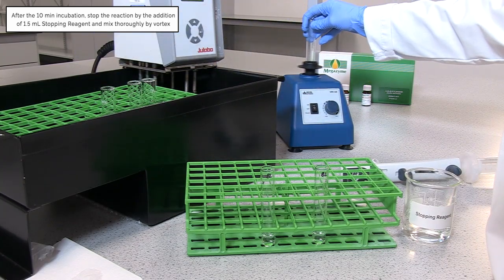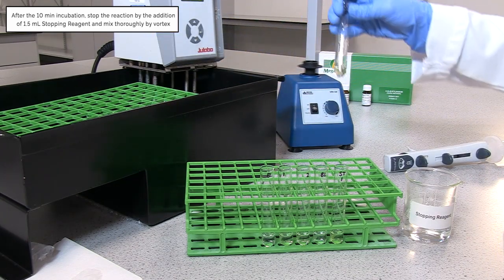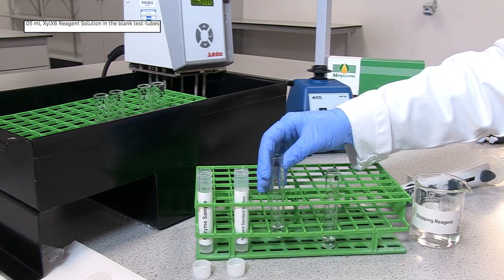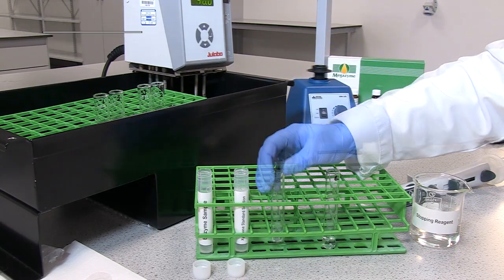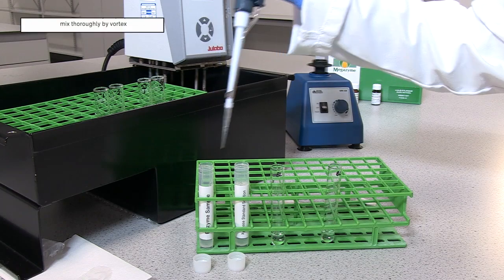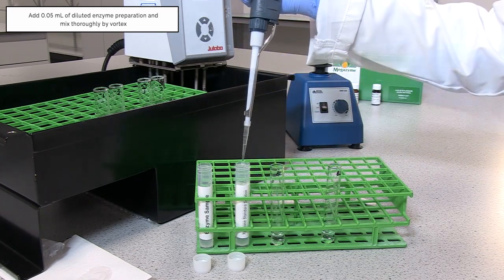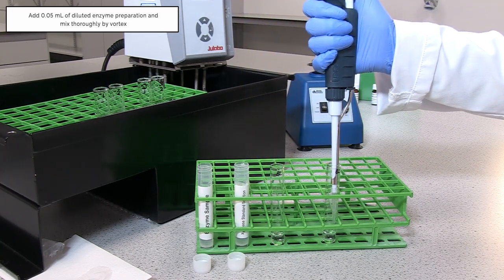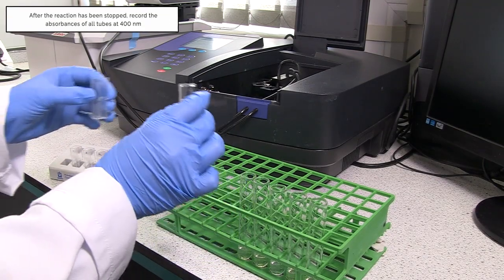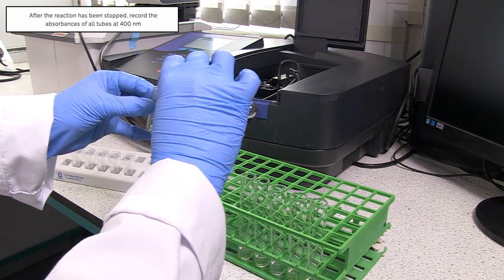After the 10-minute incubation step, stop the reaction by the addition of 1.5 ml of stopping reagent and mix thoroughly by vortex. To prepare sample blanks, add 1.5 ml of stopping reagent to 0.05 ml XYLX6 reagent solution and mix thoroughly by vortex. Add 0.05 ml of diluted enzyme preparation and mix thoroughly by vortex. After the reaction has been stopped, record the absorbance of all tubes using a spectrophotometer set to read at 400 nm.